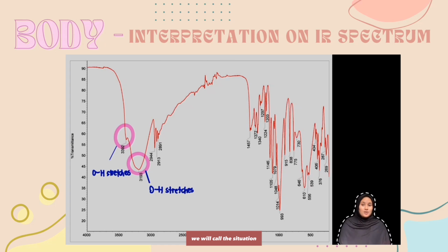We will call the situation where there is only one hydrogen attached to a carbon a lone hydrogen. The lone hydrogens in glucose are all saturated and hence will have CH stretches below 3000. However, this peak will not be as intense as typical CH stretches since there is only one bond contributing to the peak intensity instead of two or three, as is the case for methylene and methyl groups.